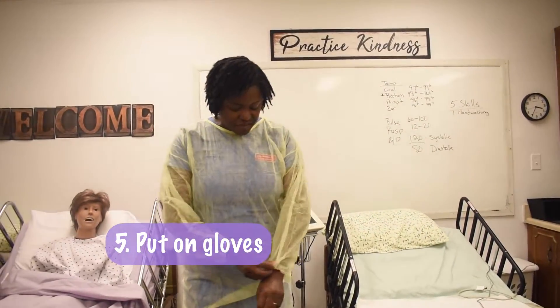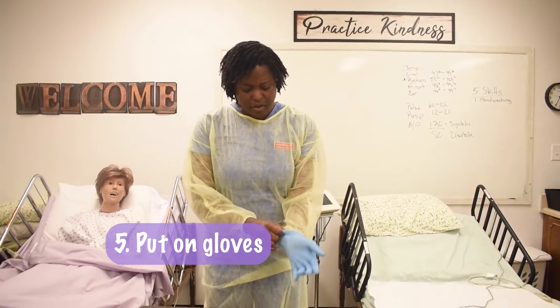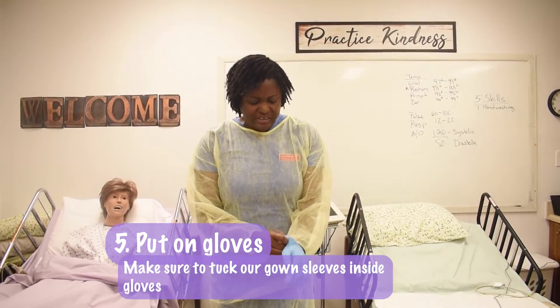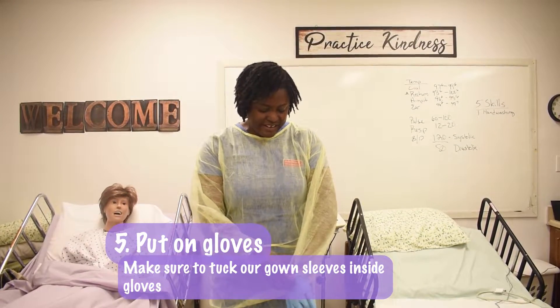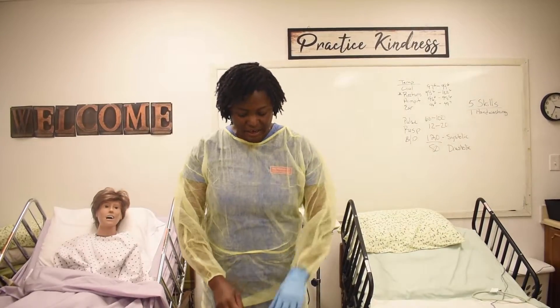We take our gloves and we put them on, but we make sure that we tuck our gown inside. We don't want to have any skin exposed.